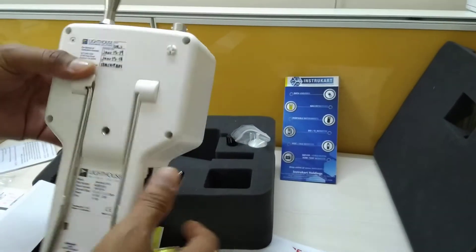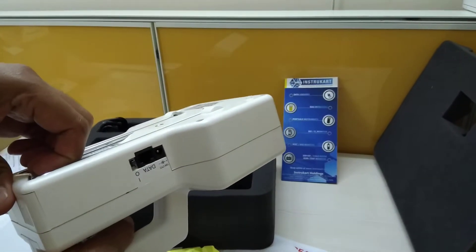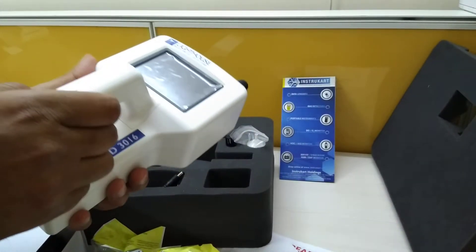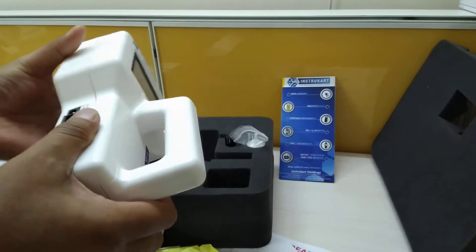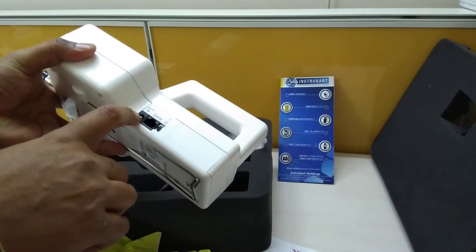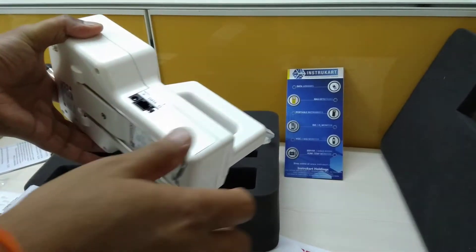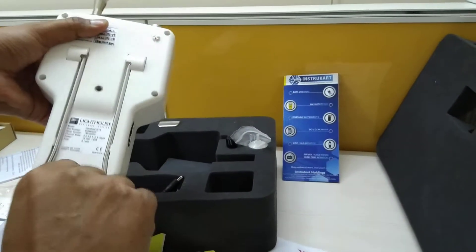It has 3000 records of data storage and comes with two years of warranty. Here we can see the power port and the RJ45 port used to transfer data to a PC.